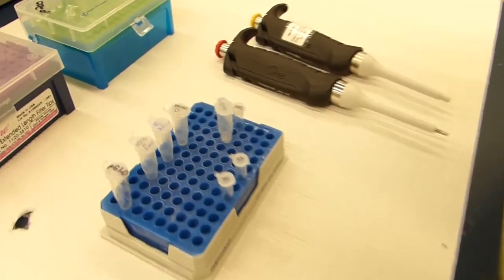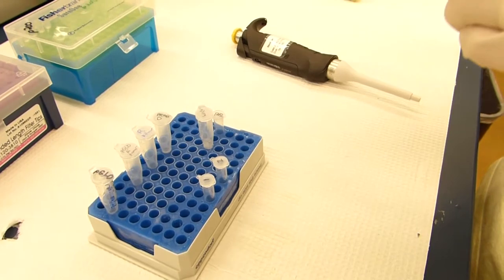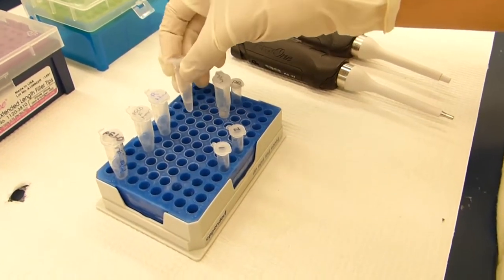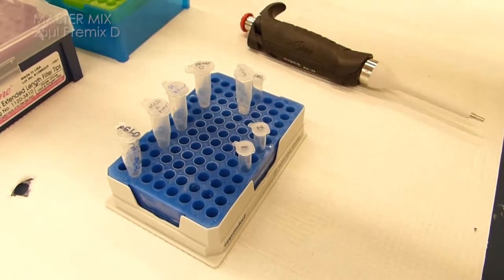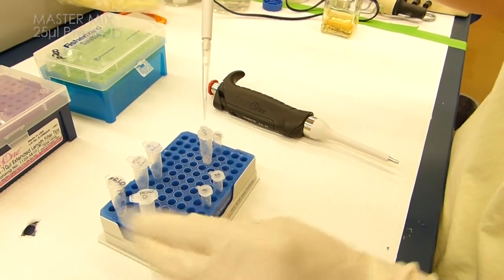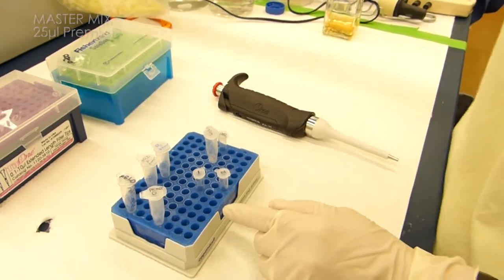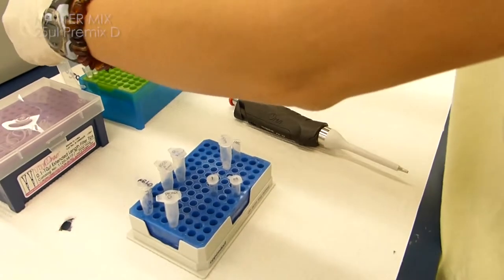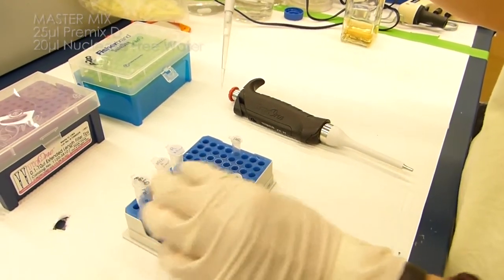We're going to set up a PCR reaction with half of the recipe as shown in the original screen, so we're going to make a 50 microliter total reaction. The Premix D from Epicenter comes as a 2x concentration, and so we will add 25 microliters of the Premix D to our reaction. We'll make the master mix first and then aliquot it into a fresh tube. So we've added 25 microliters of the Premix D. Next we'll add 20 microliters of the nuclease-free water — this is water for molecular biology.